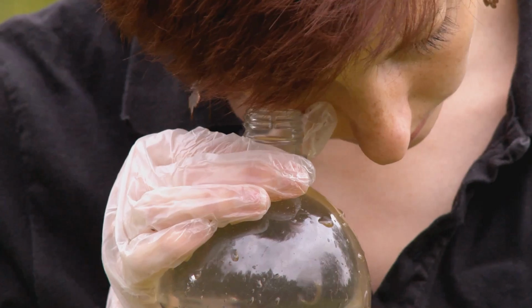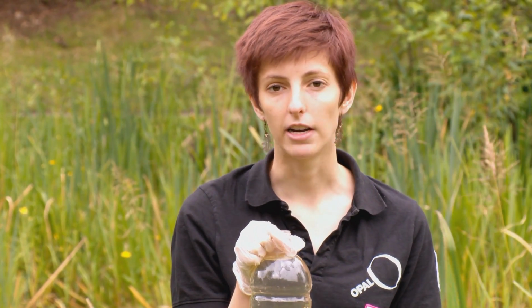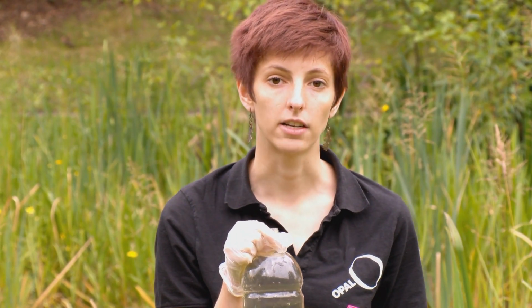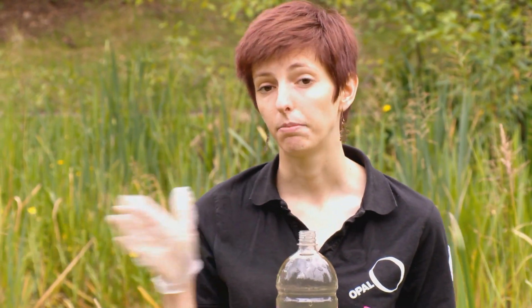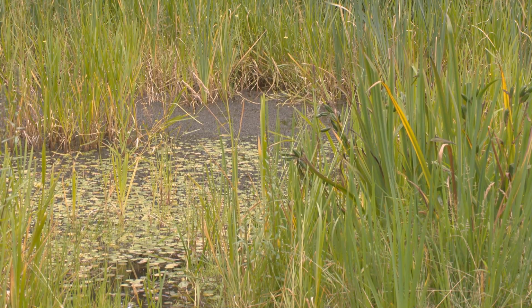So in this pond, I can see 12 of the grey discs at the bottom here on the opalometer. This means this pond is nice and clear. As you can see, there's plenty of plants, and that probably means there's also plenty of animals in there too. So this pond is looking nice and healthy.